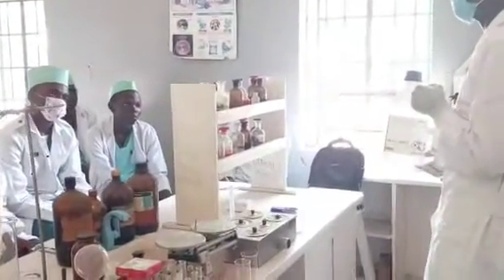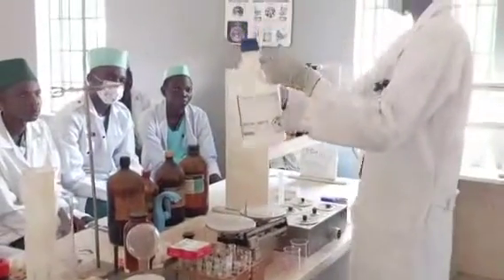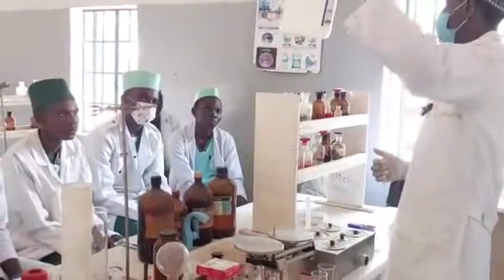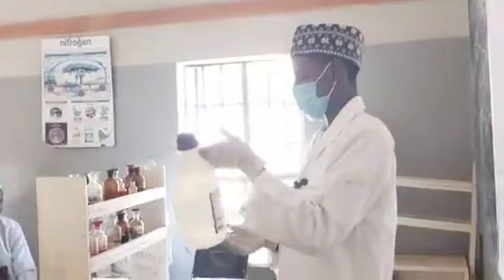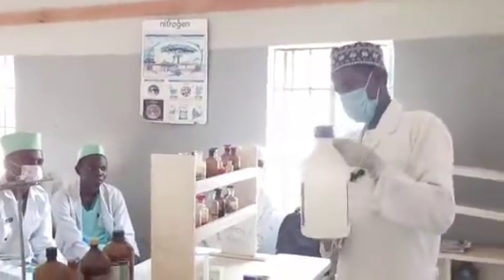That is why it is stored in this rubber container. You cannot store hydrochloric acid here, because of its corrosive nature. So this is also another factor to be considered. Is that understood? But you see the labeling, it is flammable.